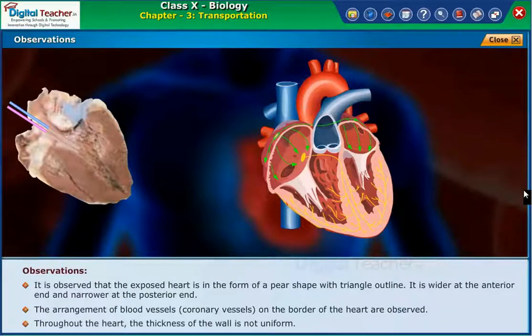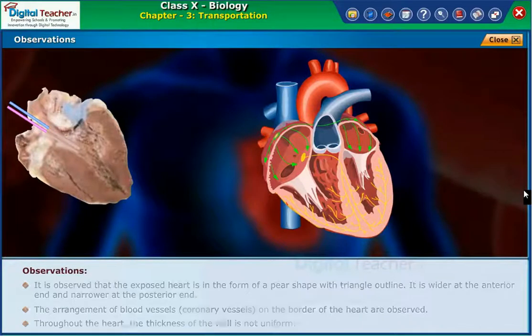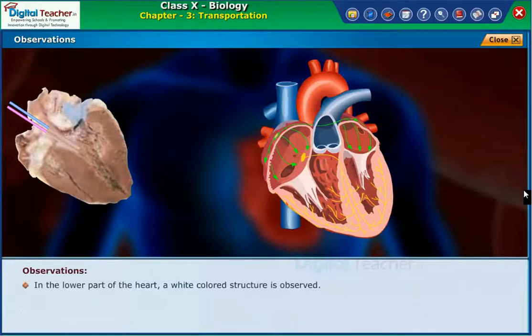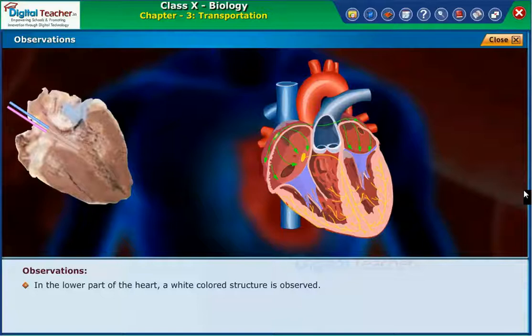The arrangement of blood vessels and coronary vessels on the border of the heart are observed. Throughout the heart, the thickness of the wall is not uniform. In the lower part of the heart, a white colored structure is observed.